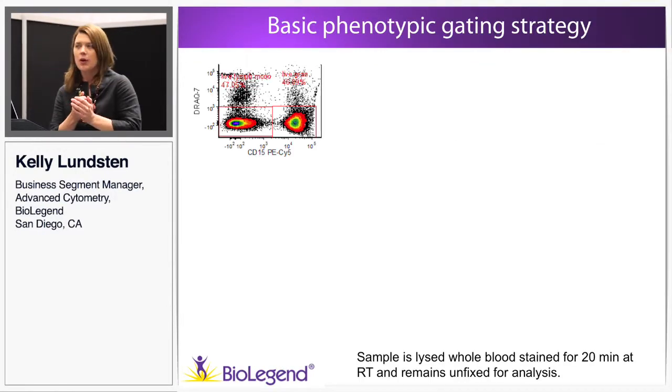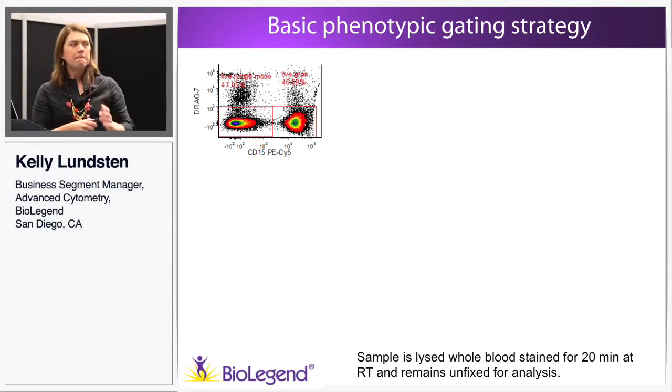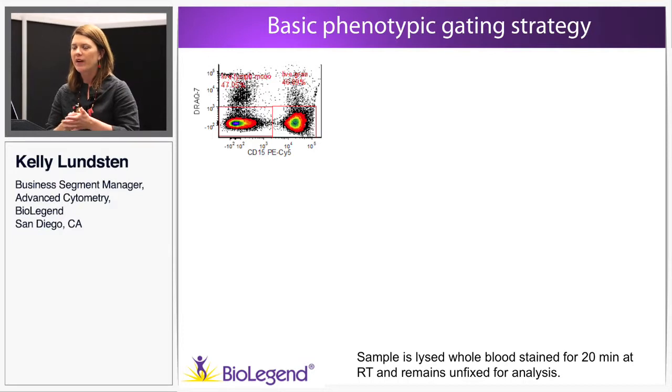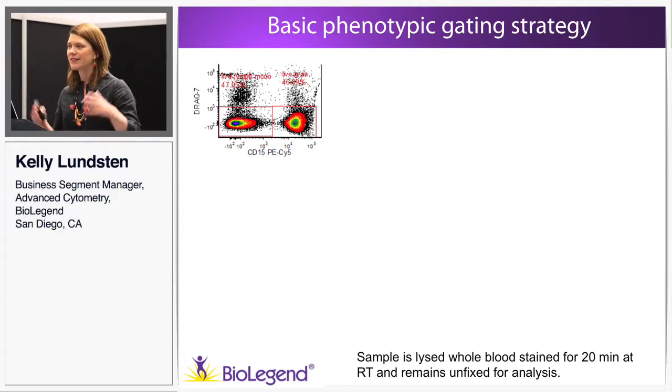All right, so I'm just going to go through my basic phenotyping structure really quickly. We have maybe 15 minutes left here just to go over the data. I always feel like every time I do a big experiment, what I learn most is almost always about software and the challenges of analysis. It is easy to acquire. It's not even that difficult to plan the assay. It's on the backside, when you have multiple samples, humongous files, and all the error that's in there, that you have to parse all that out.